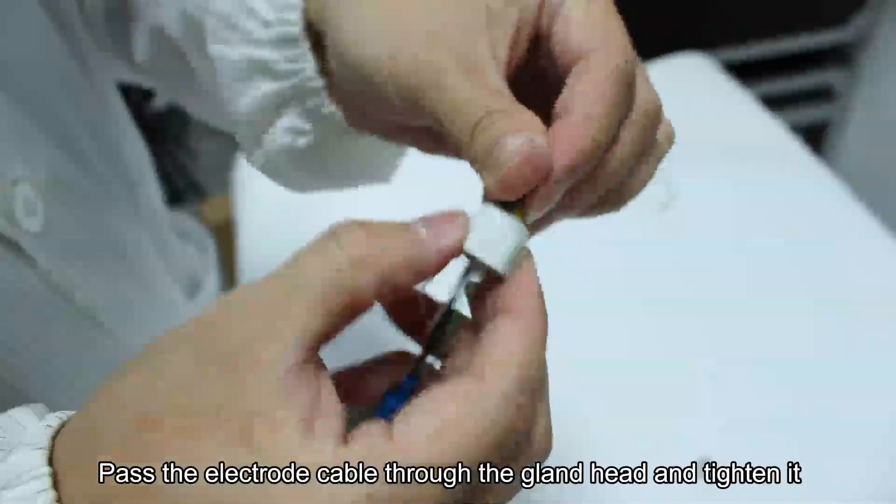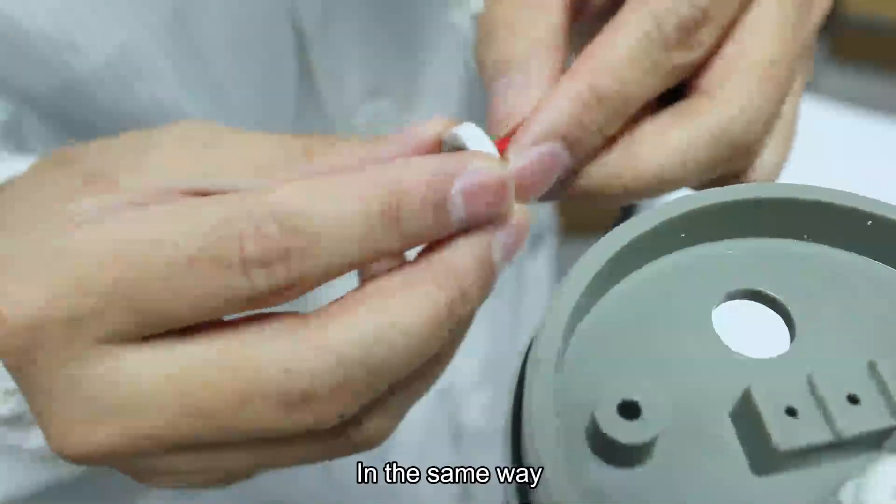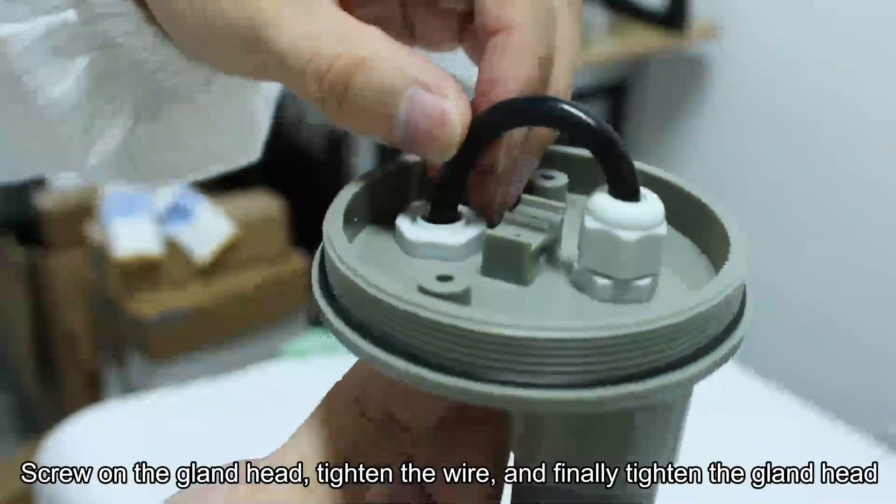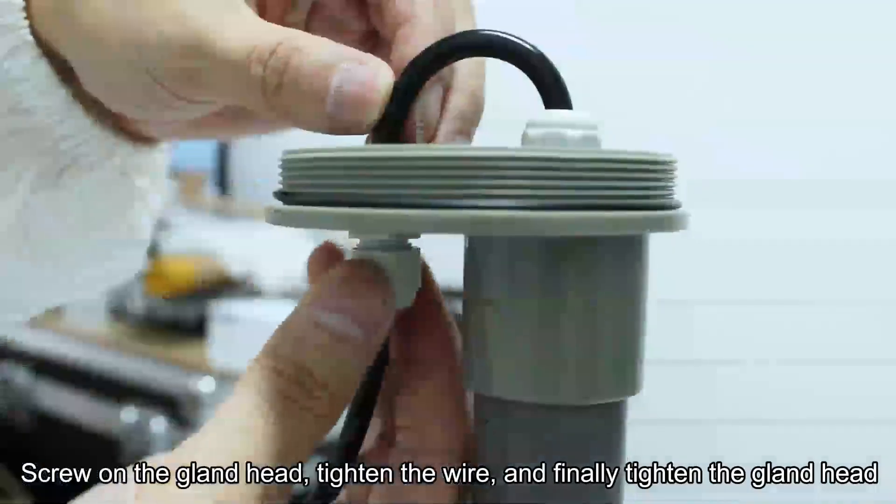Pass the electrode cable through the gland head and tighten it. In the same way, we pass the electrode cable through the other hole of the waterproof cap. Screw on the gland head, tighten the wire, and finally tighten the gland head.